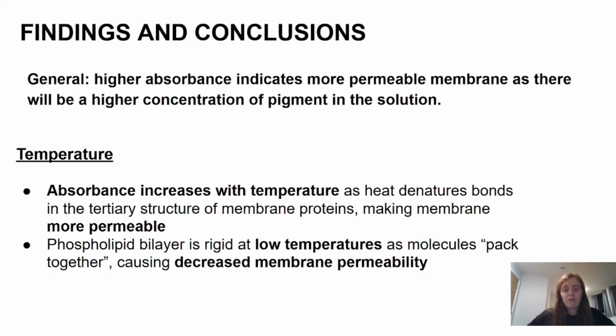And this denaturing of the membrane proteins means that the membrane proteins can't function. So this means that the membrane is more permeable, because the membrane proteins control what comes in and out. So if they're denatured, it will make the membrane more permeable.